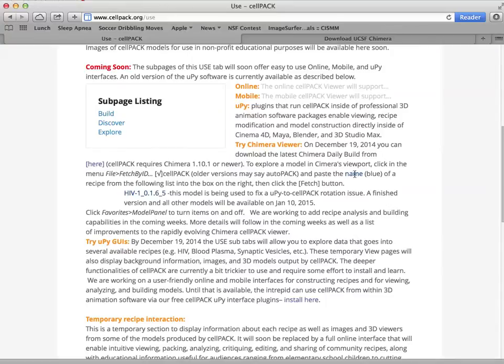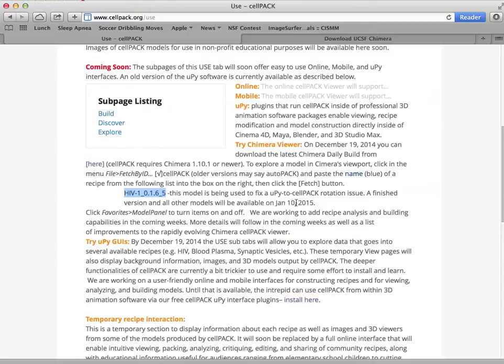And then within Chimera, you can grab an ever-growing list. As we can see here, we'll be updating this to the full recipe list by January 10th. We're just fixing some UPy to Chimera visualization conversion issues right now.